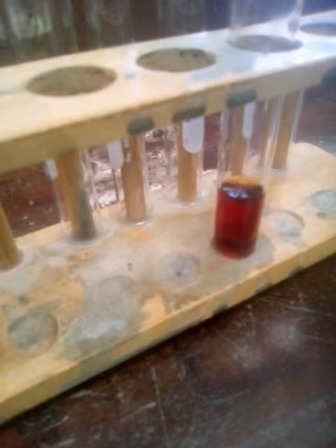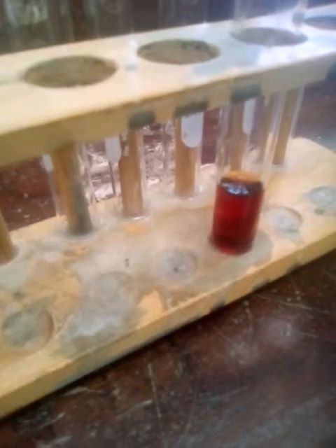So in this reaction, the potassium iodide is decomposing the hydrogen peroxide, and that is causing an end product of this reaction to be oxygen gas, which is seen in the form of bubbles or effervescence. We are now going to test for one of the products of this reaction.